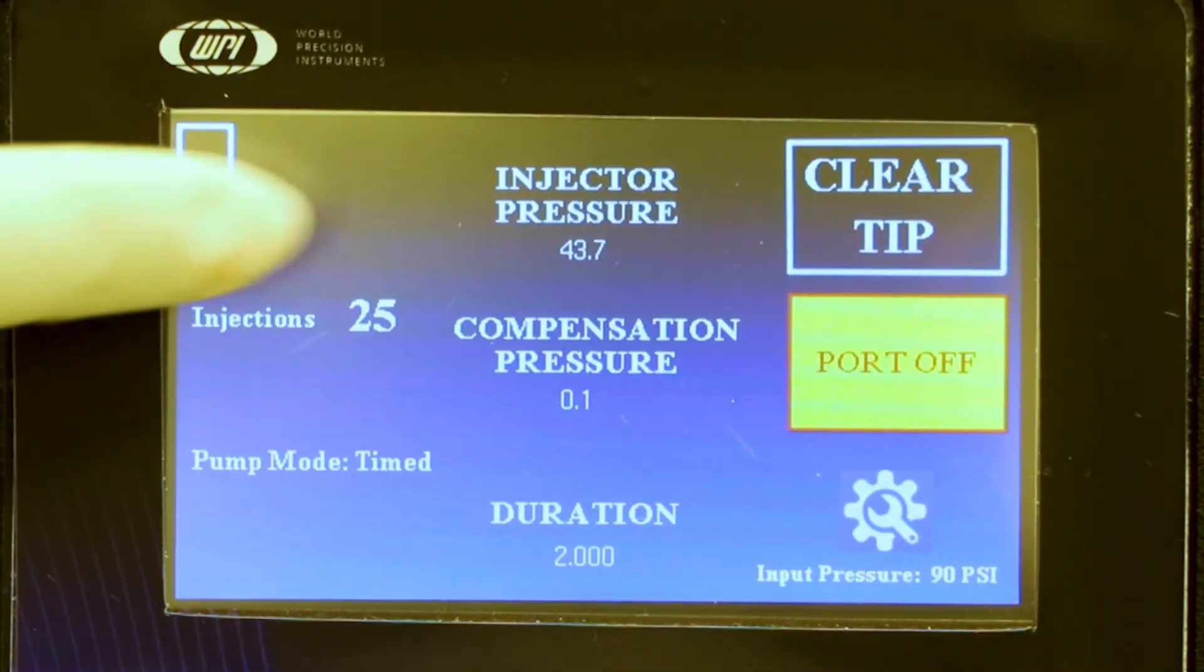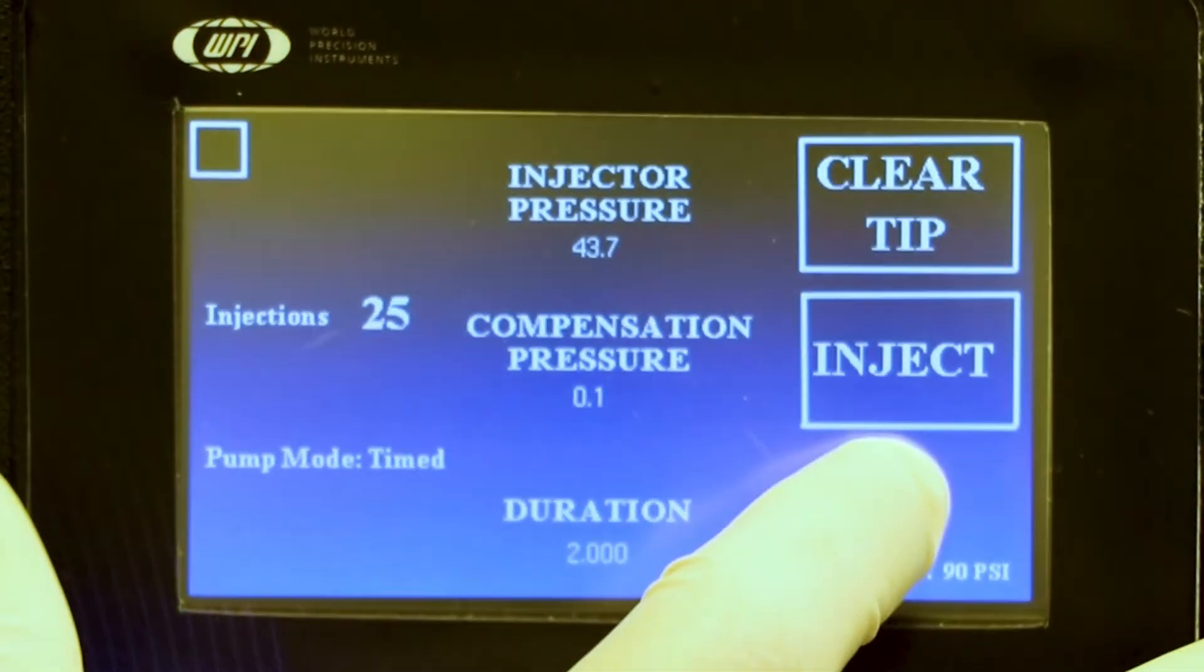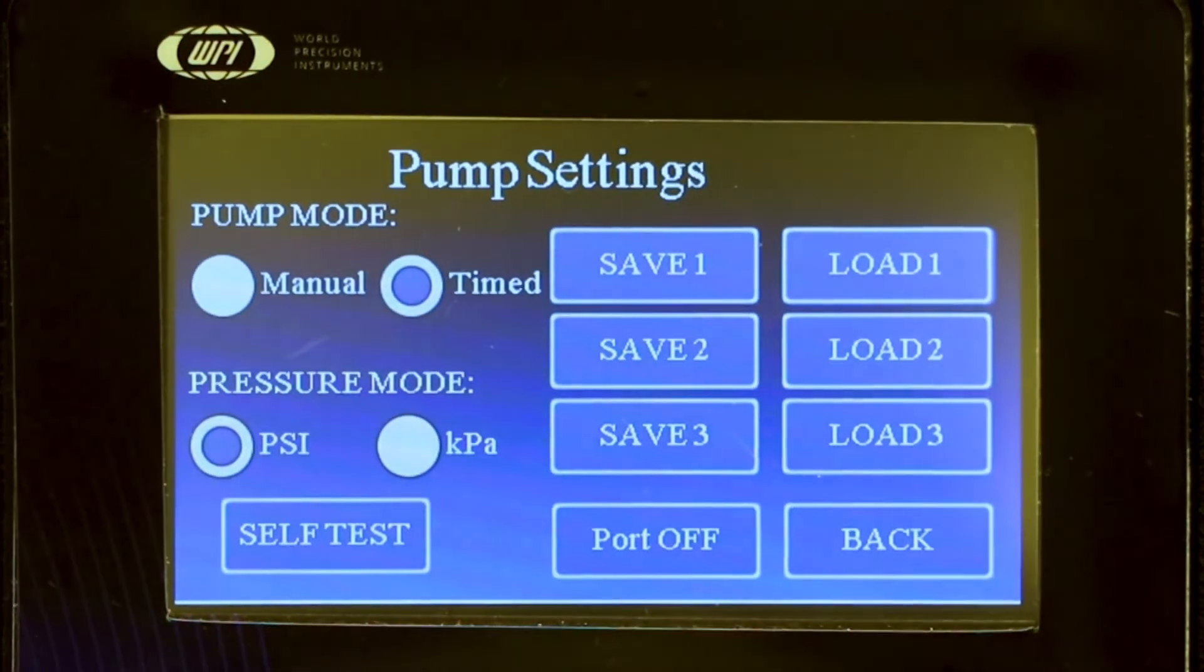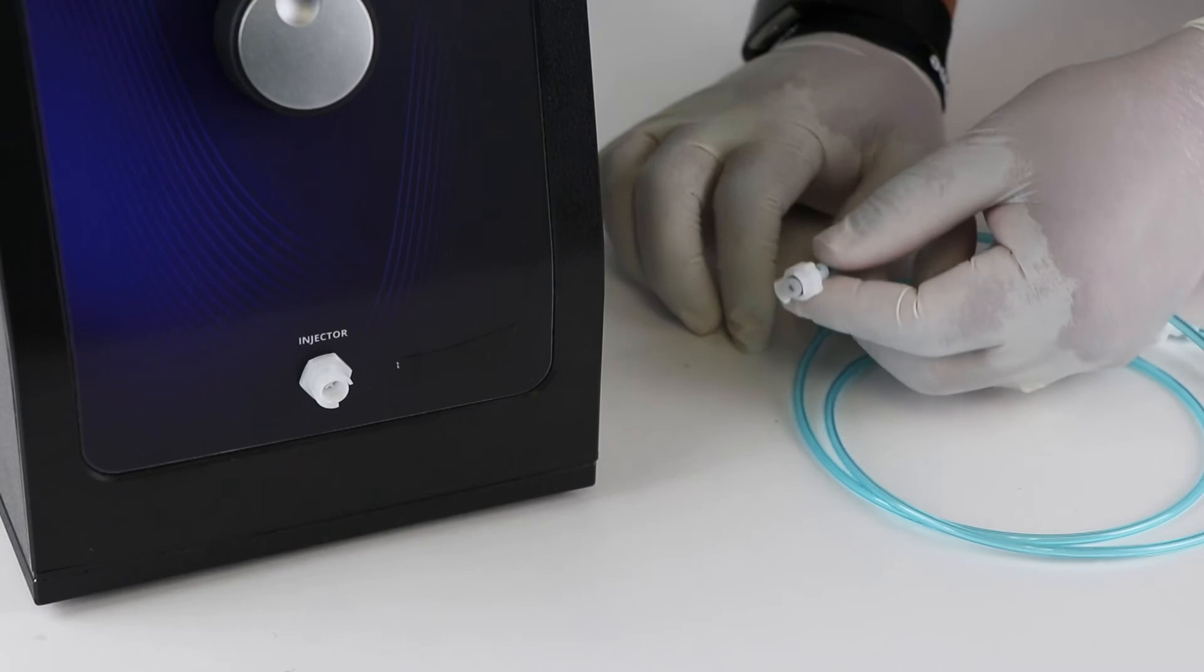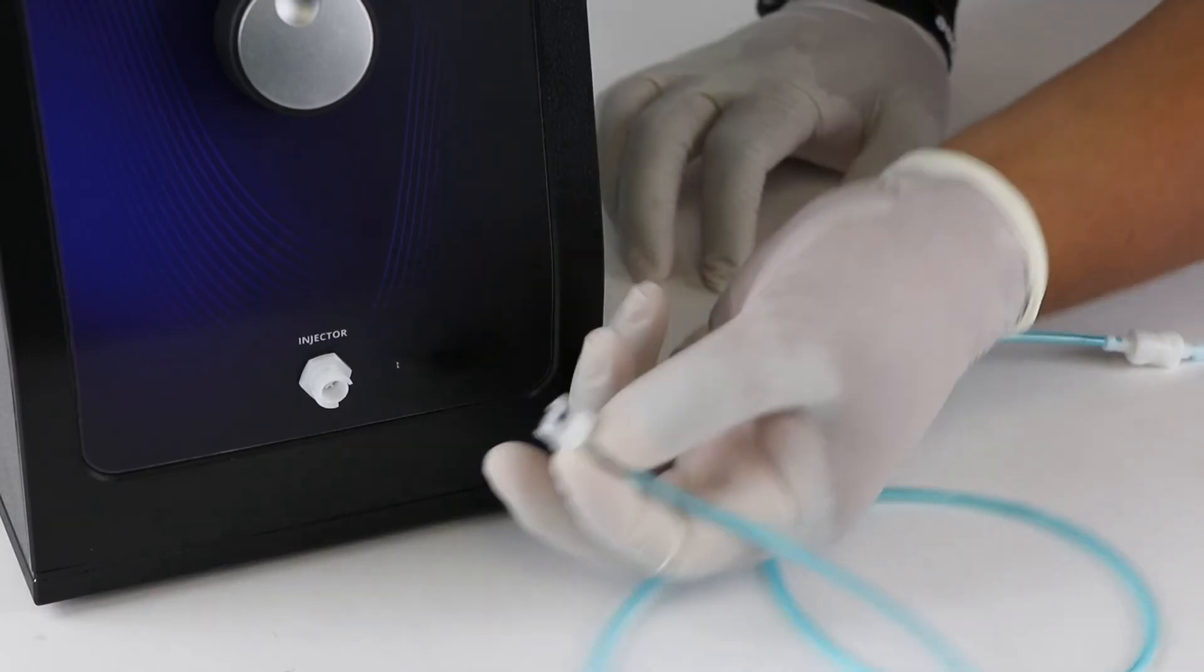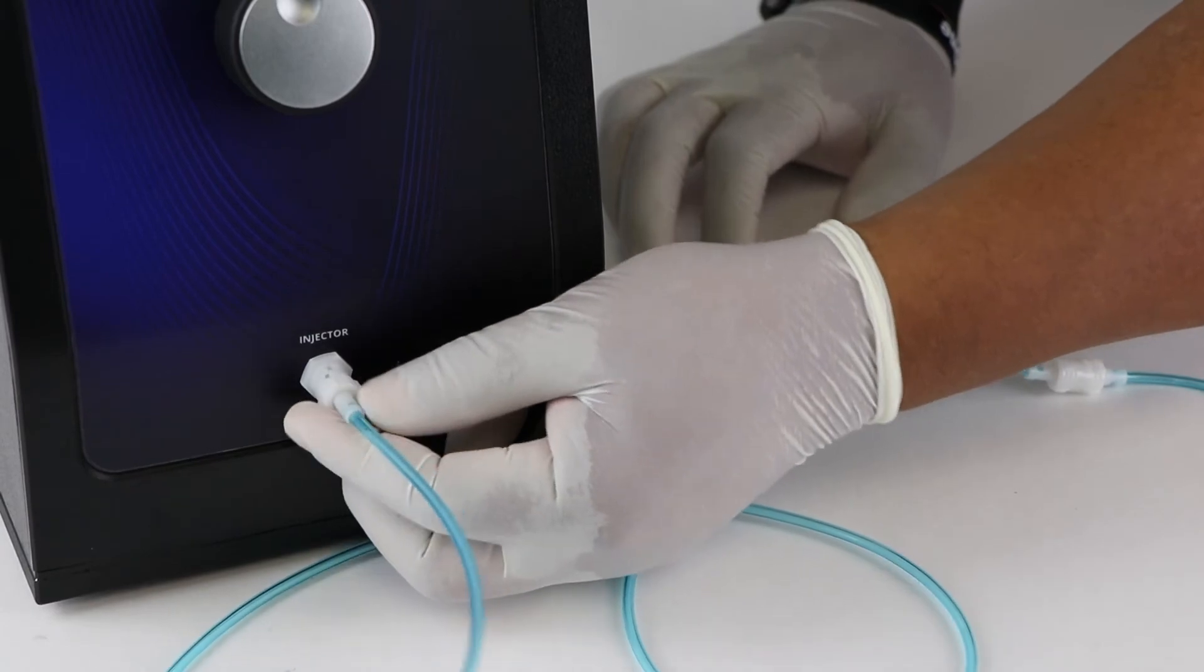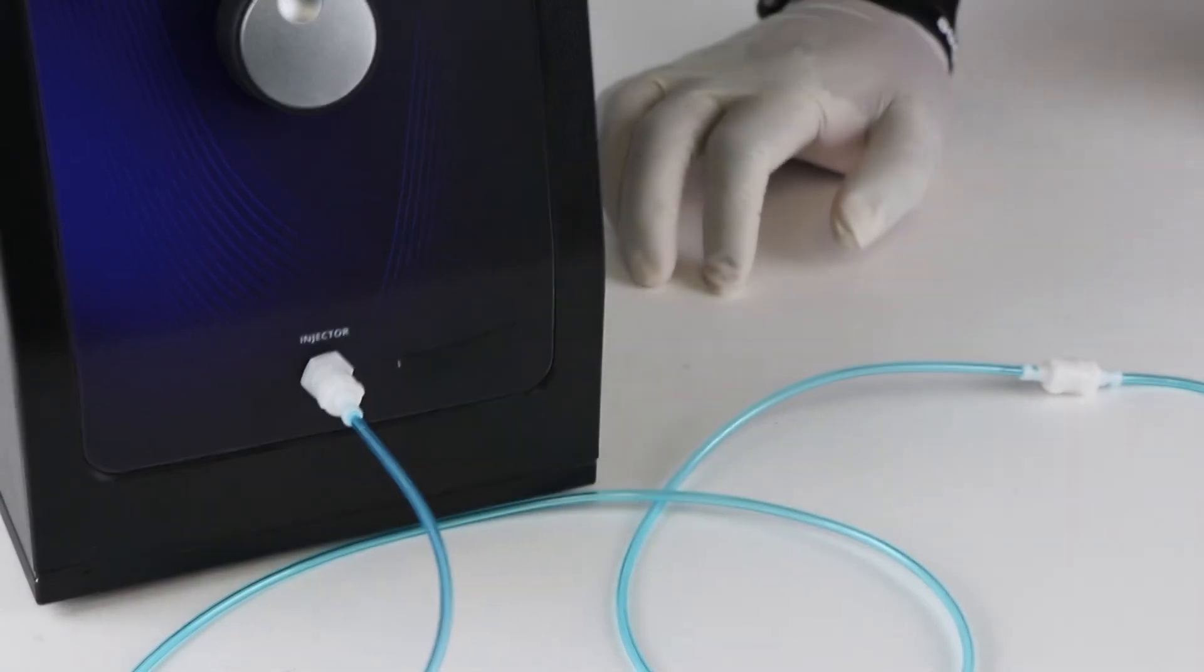Verify that the injection port is disabled. If not, touch the settings area of the display to access the settings menu and touch the port on button to set it to port off. Align the Easy Connect connector with the injector port on the front of the PV850. Slide the connector securely into the port and attach it with a slight clockwise twist.